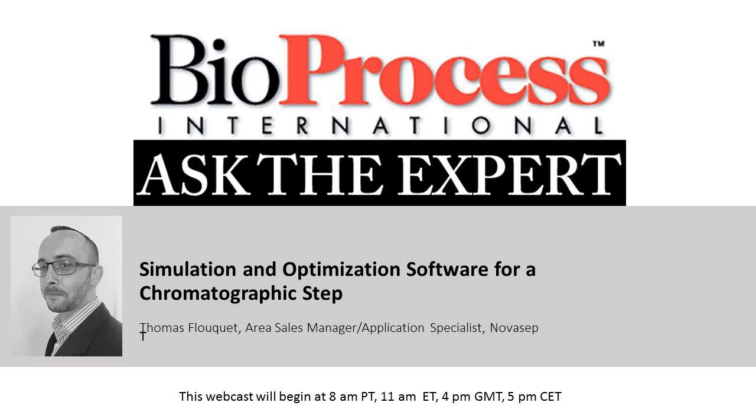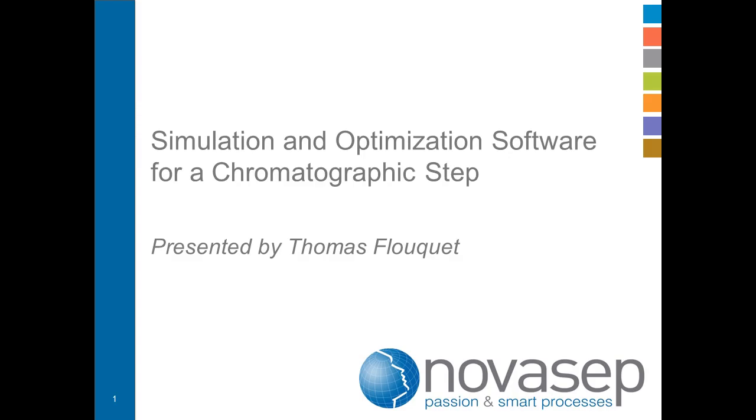Thank you. Hello everyone. I will present to you today a simulation software called Biosc Predict, which is a software to maximize your chromatography steps, either for batch, parallel batch, or multi-column steps. By maximizing, I mean increasing your productivity or decreasing your cost of goods. For information, that software won the Arkema Innovation Award 2015.